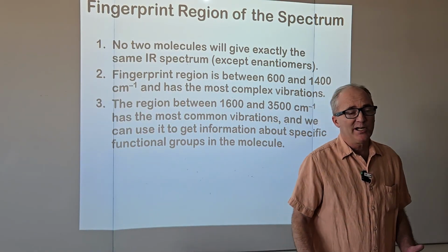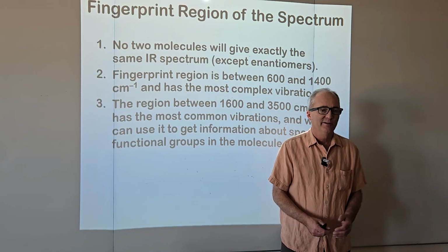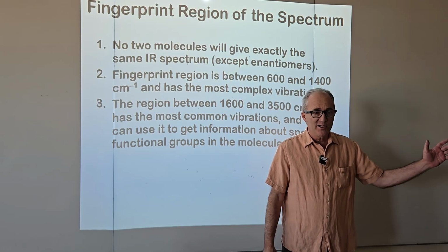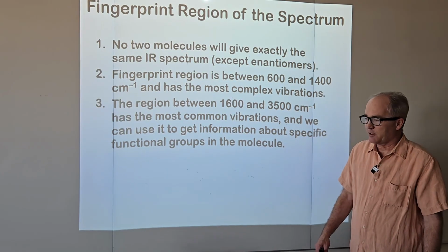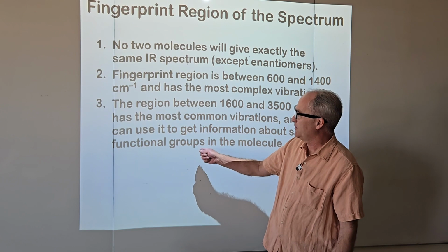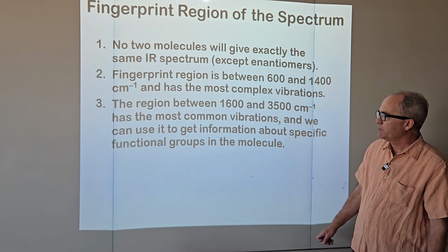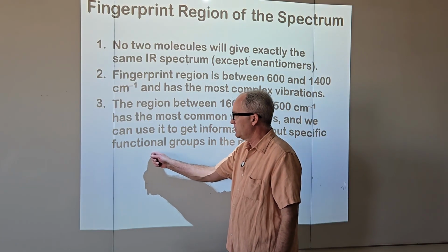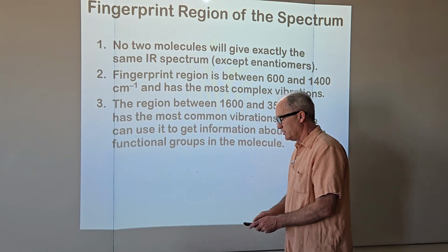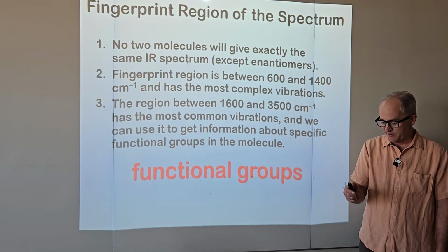So for the next 20 days, I'm going to come in here and say, what does IR spectroscopy tell you? And you're going to say, what functional groups are there? Just like saying charge delocalization for all those other questions you get asked that are easily explained. Infrared spectroscopy tells us the functional groups in a molecule. Must be a big deal. It was animated and in red and bold.